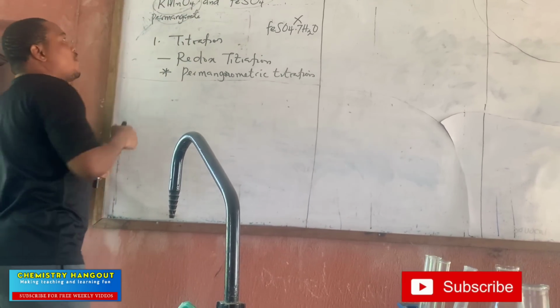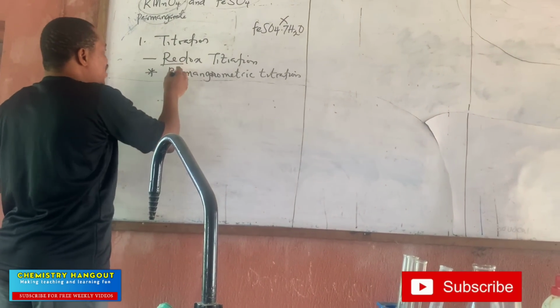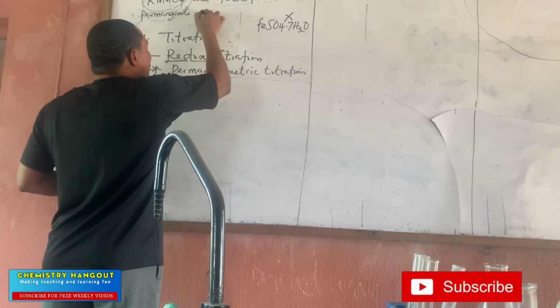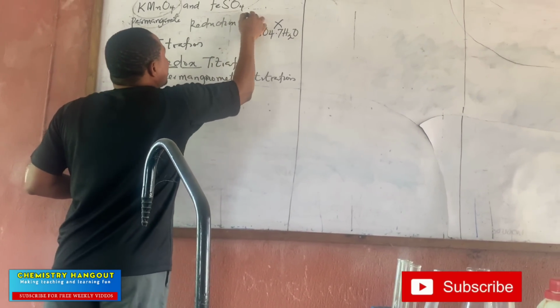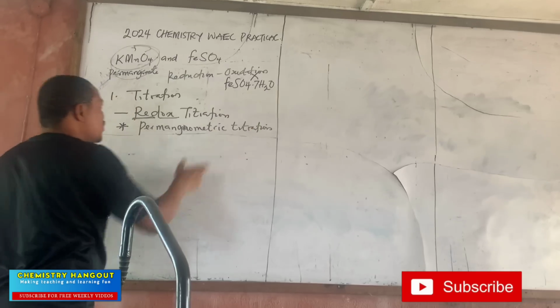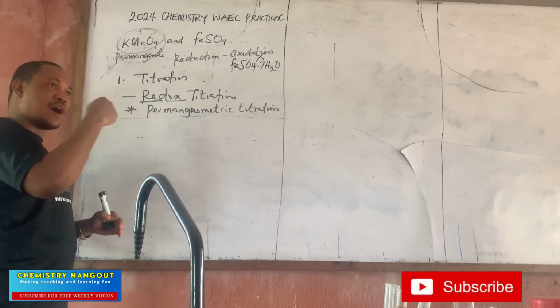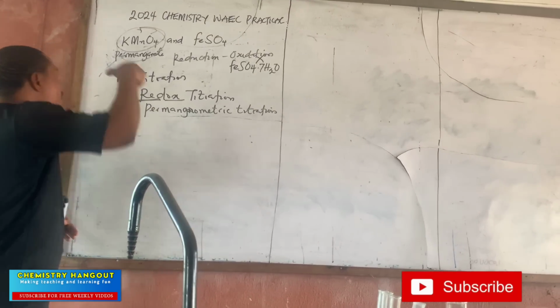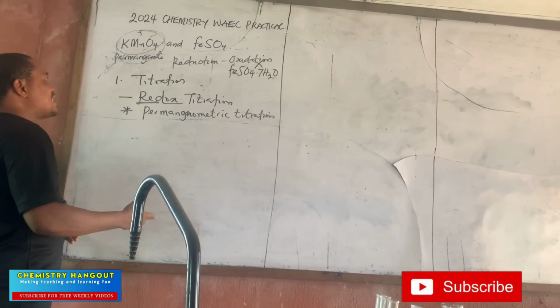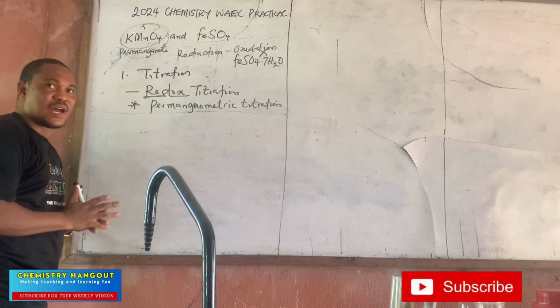Now, take note of this. Your KMnO4 here is acting as the oxidizing agent, because in redox, the meaning of redox is reduction, oxidation. You get that now? So the short form is redox. And very important, if you know the words reduction, oxidation, you should know we have a reducing agent and an oxidizing agent. So in this very particular titration, your KMnO4 will be acting as the oxidizing agent, while iron 2 sulfate will be acting as the reducing agent. I want to believe that is clear.